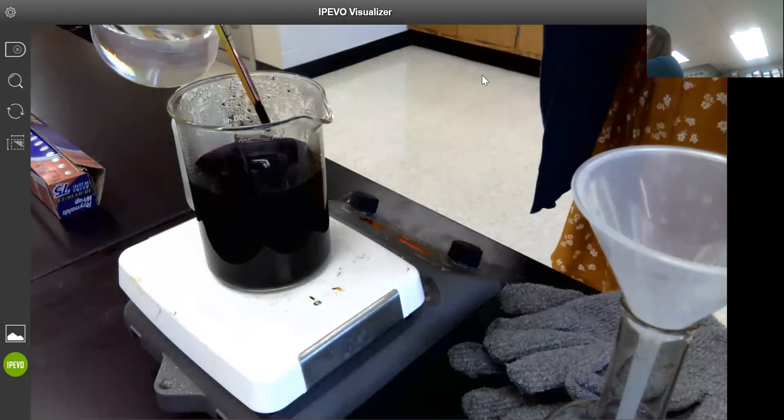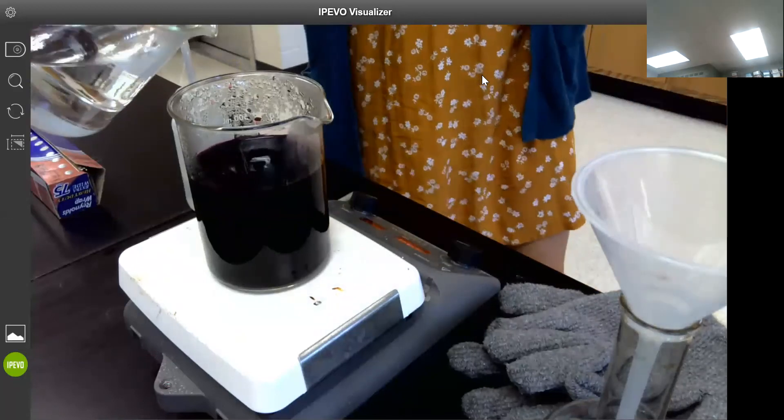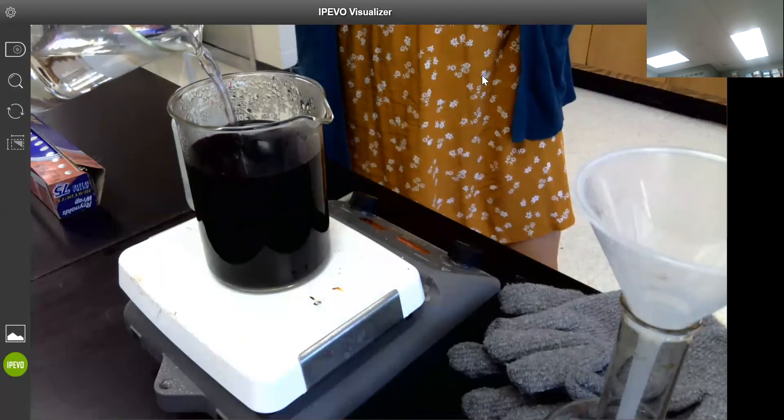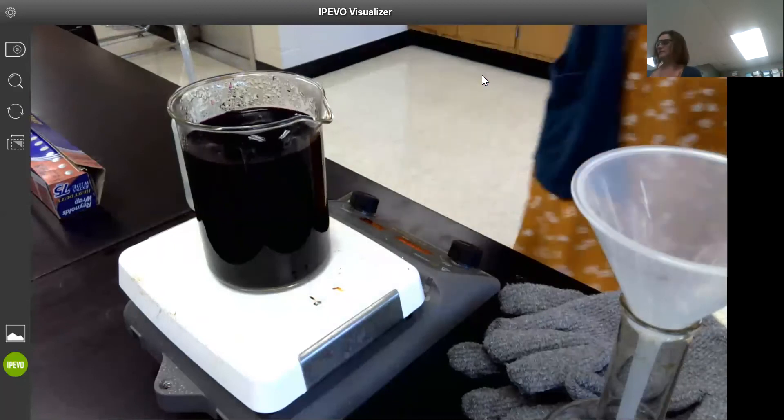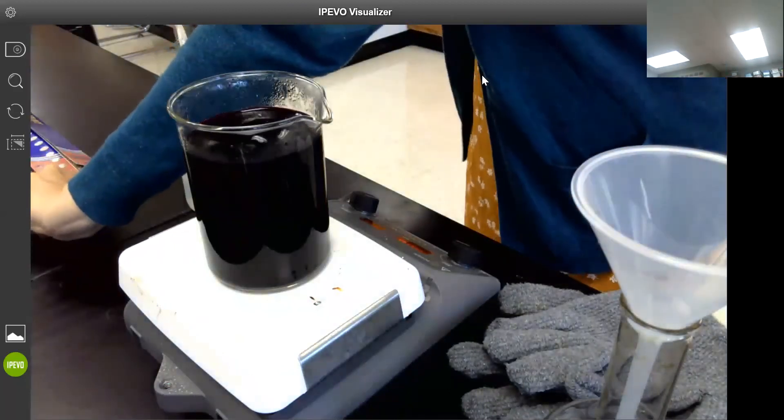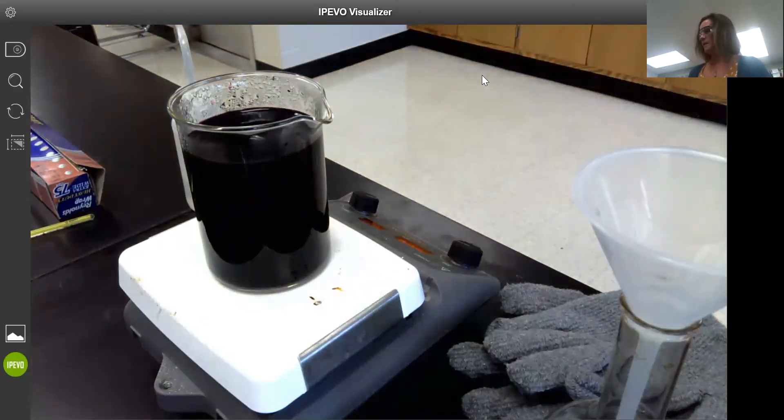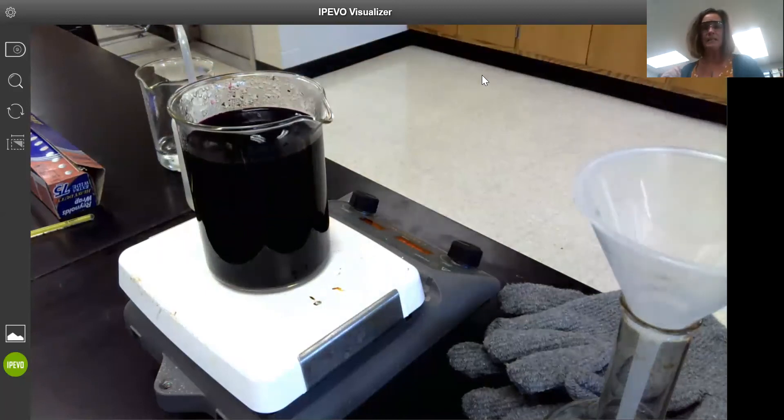Just using the lines on the beaker, I'm going to add enough water to get up to about 500 milliliters. Again, none of this really matters as to how much water we're adding because we are going to be standardizing the solution, and so we will eventually be determining its exact concentration.